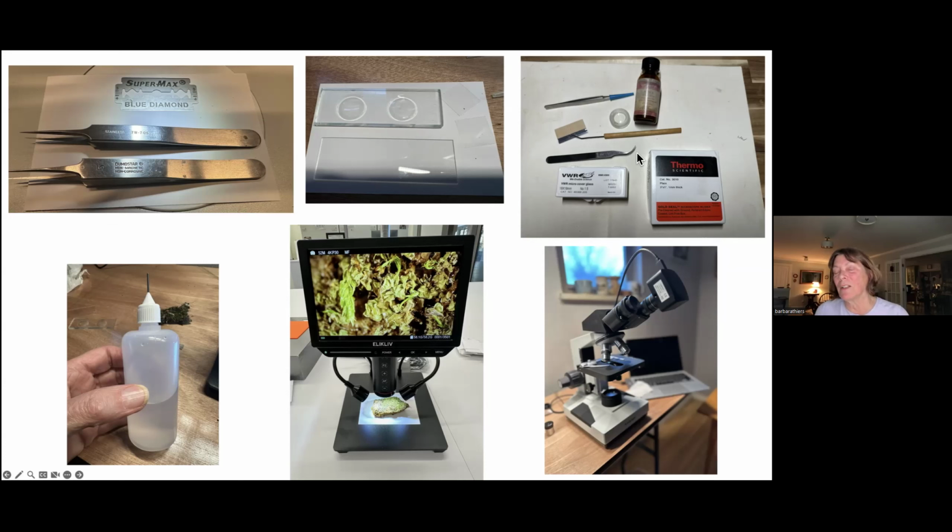My husband and I share a home lab, and I just took a picture of some of his tools. You can see some are the same, but he likes curved forceps. He works on fungi, so we don't work on bryophytes, but the tools are the same. He likes curved forceps and a needle, and he uses a single-blade razor blade. He uses a watch glass instead of a depression slide for initial wetting.